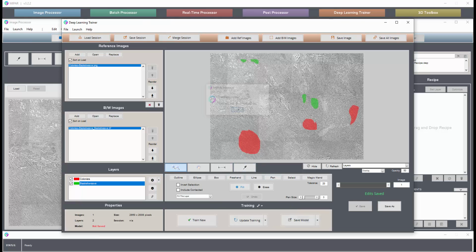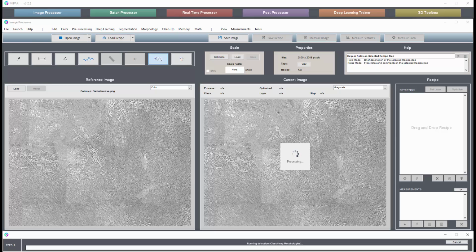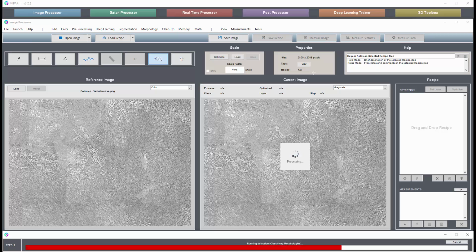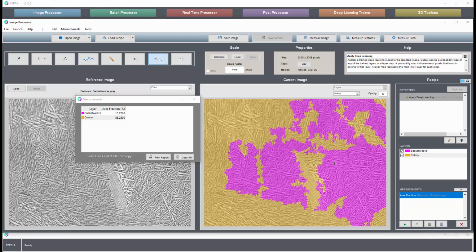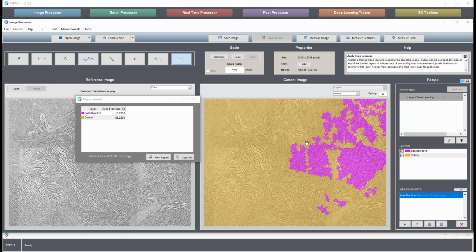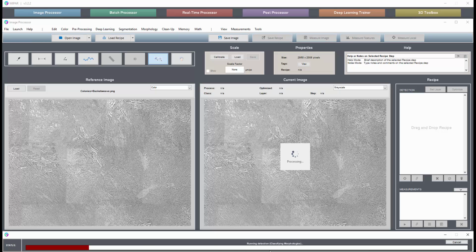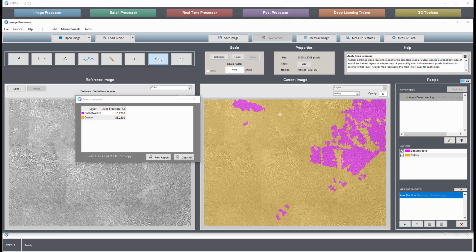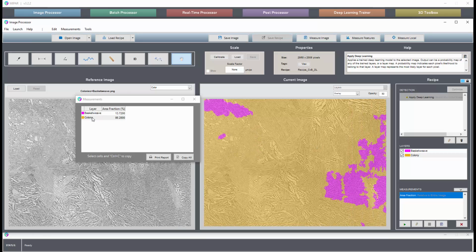So let's stop that. I'm just going to load the result over here. We had a recipe that used that trained model. And what you'll see it produce here is the full segmentation of colony and basket weave. Now, when run on all 50 samples, as part of a batch process, it took about 2 seconds per image. Even if I ran this now a second time, this should run more quickly. So this was able to reduce their processing time down from 8 hours a day for a sample to about 2.5 minutes per sample. And you see the result of the recipe here.